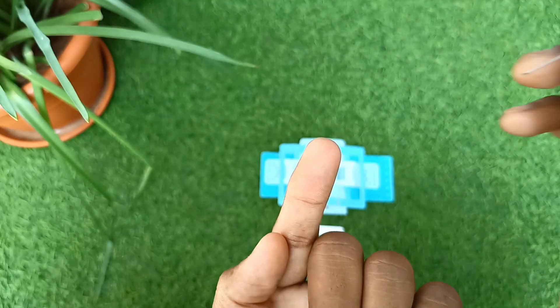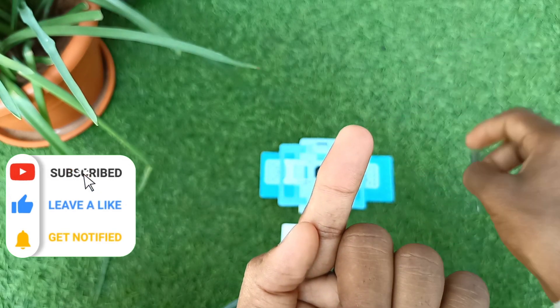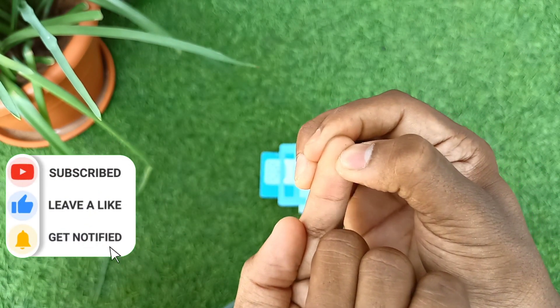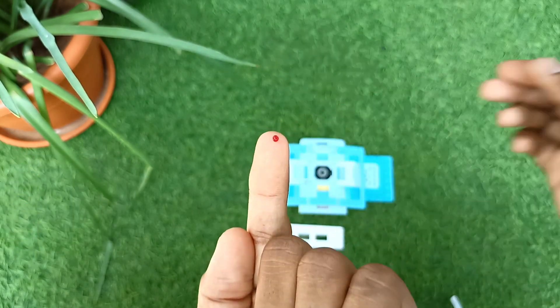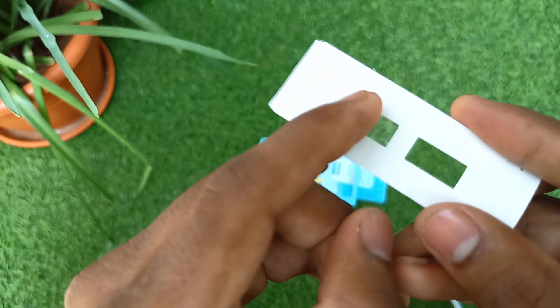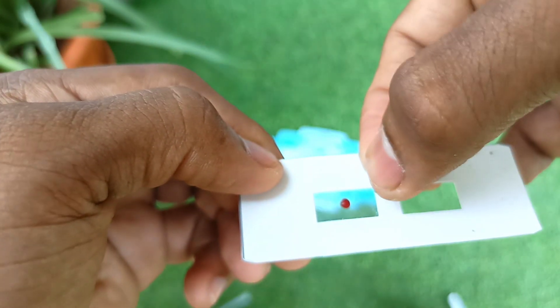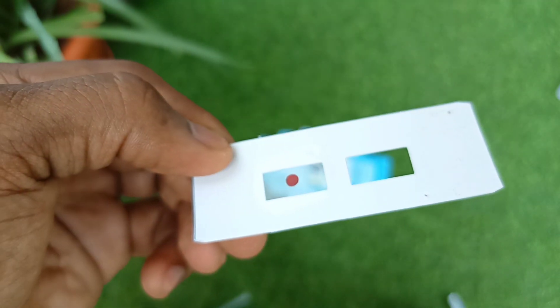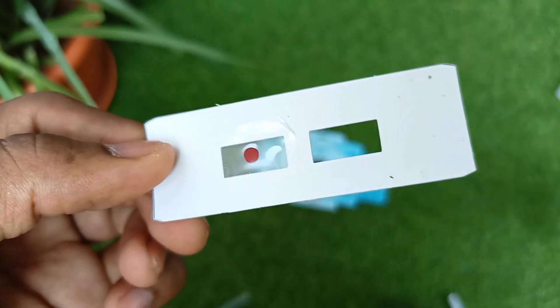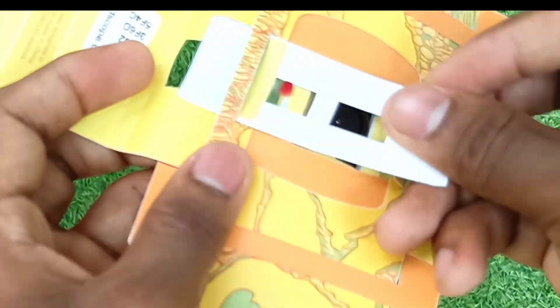Hey, what's up guys! This is Ram and you're watching Infinity Explorer. Let me take a blood sample — I'm using a syringe needle. Let's squeeze the blood out, take a slide, place a drop on it, and cover it with a cover slip. Gently place it on top. Now your slide is ready to be watched. Let's place the slide in the Foldscope.